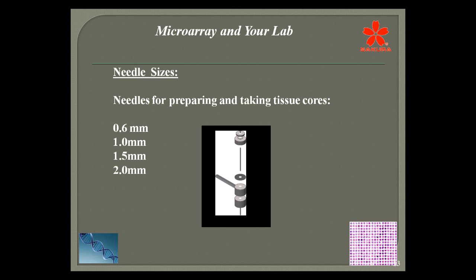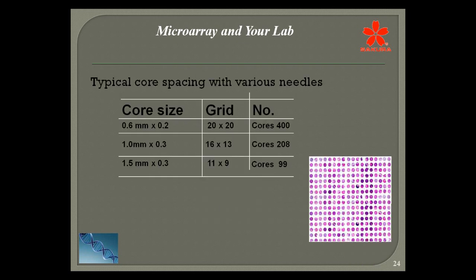If you're certainly on a very, very low budget, one of the 2 millimeter derm punches, if they actually take punch biopsies of skin that has a little stylus in it, is a good little tool, or certainly if you're making one very quickly, you can take cores with this derm punch, and they're 2 millimeters, which are a very good size.